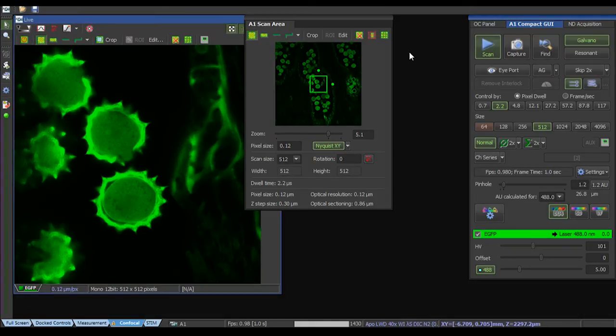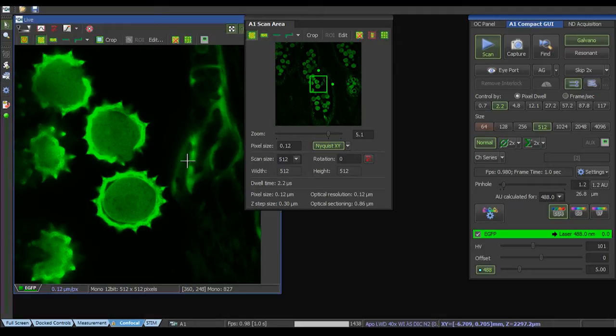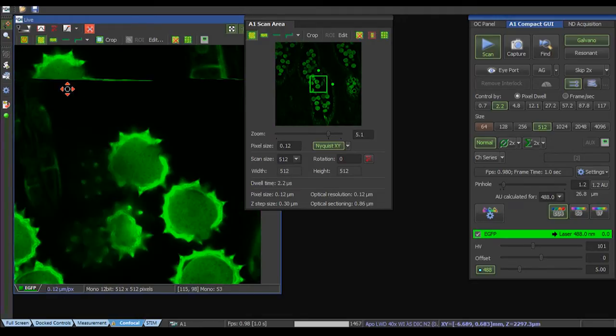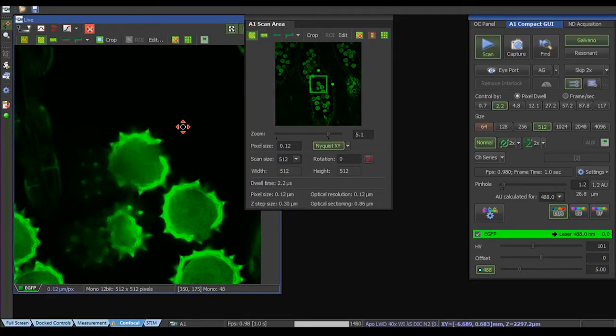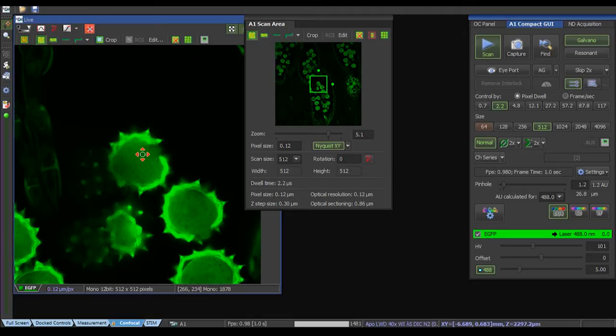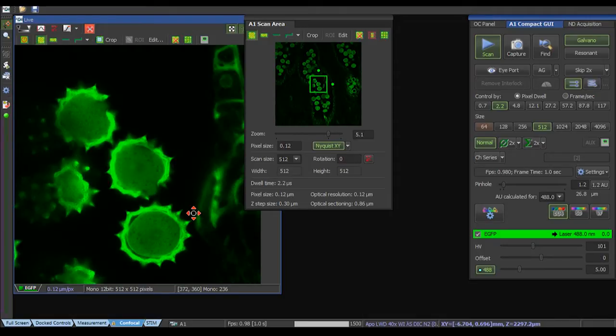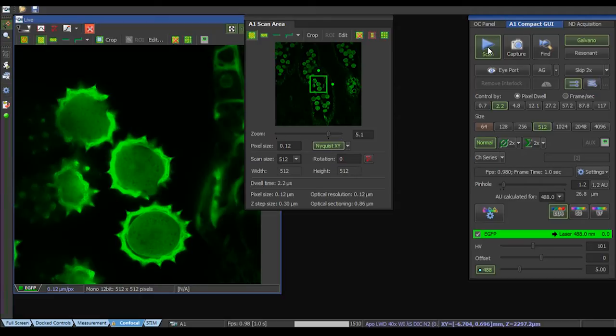So this is our confocal image. It's possible with this little button here to move around our image. Double click will center where we would like to measure. For example I would pick this daisy pollen here and to stop we just click scan again.